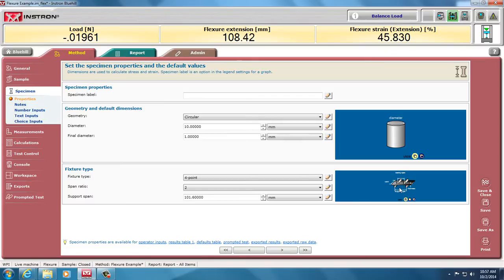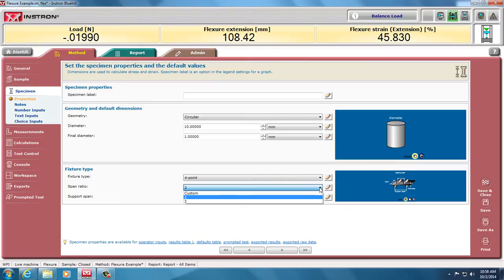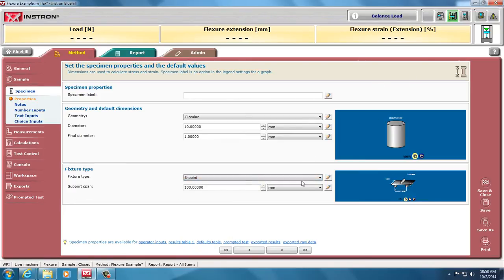The span ratio is the ratio of the support span over the loading span. So in this case, it's two to one. You can use three-to-one or other custom measures. I've set my span to be 100 millimeters, and I'm doing three-point bending.